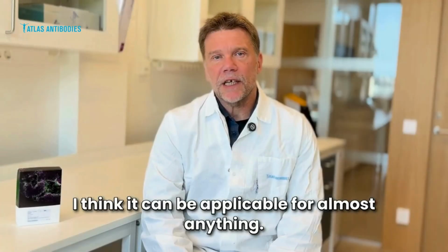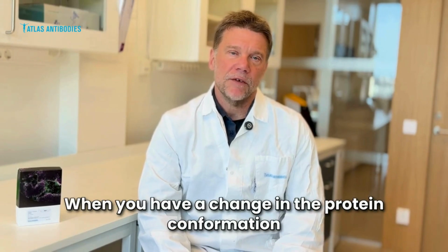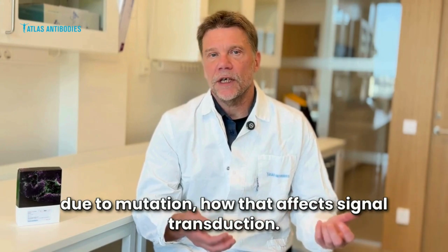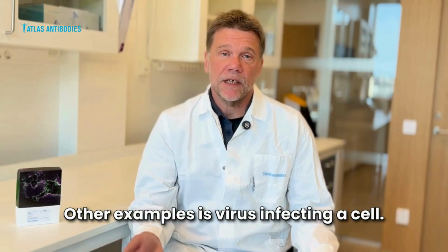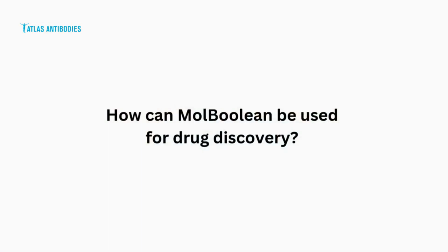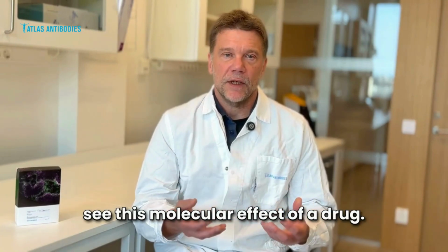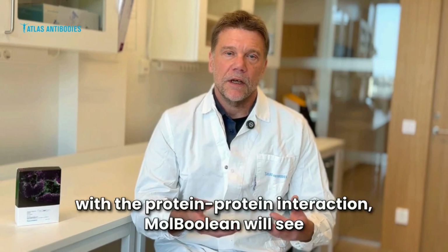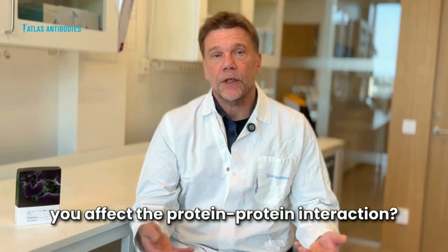I think it can be applicable for almost anything, but of course cancer will be one example, when you have a change in the protein conformation due to a mutation, and how that affects signal transduction. Other examples are a virus infecting a cell: how does it affect the protein machinery in the cell? So I think it can be used to see this molecular effect of a drug. If you have a drug that can interfere with the protein-protein interaction, MolBoolean will show whether you affect the amount of protein or the protein-protein interaction.